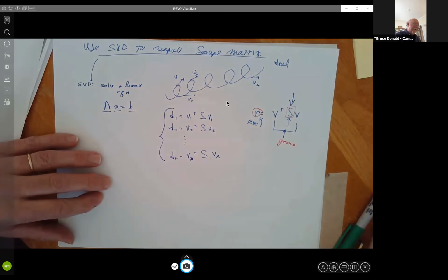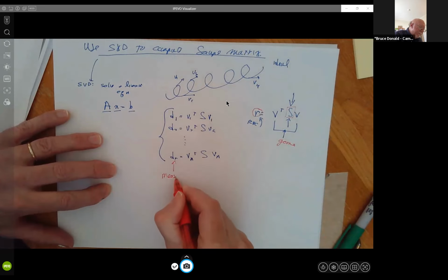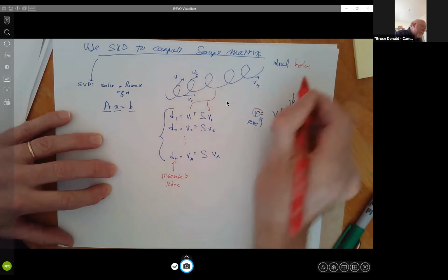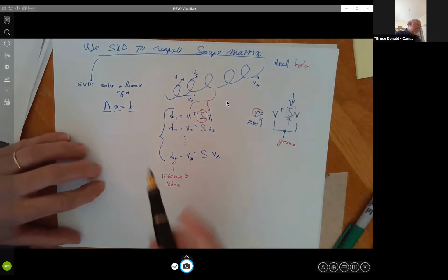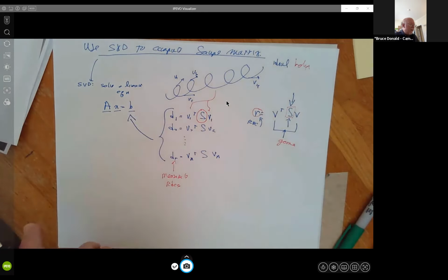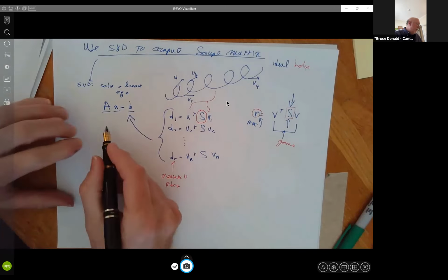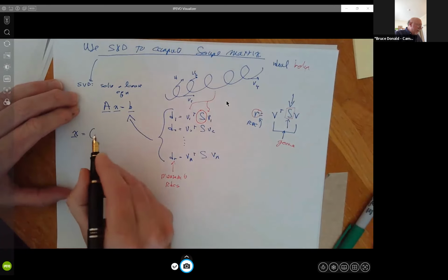Again, think of what I have here. These are my measured RDCs. These are my vectors, bond vectors, and they come from my ideal helix. And S is my unknown. And so I can transform this into a system like this, and SVD will give me the optimal least squares solution to it, and it runs in polynomial time. And in this way of thinking about it, my unknown X, just for fun, looks something like this.